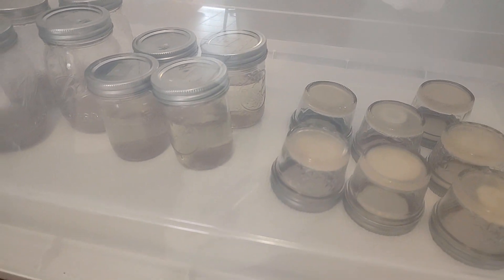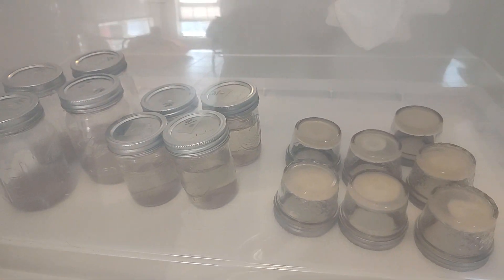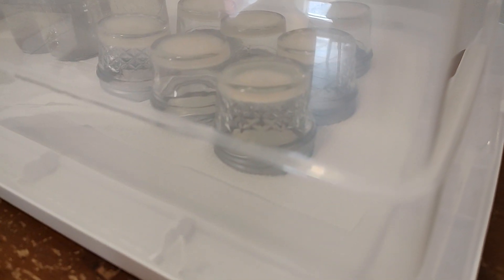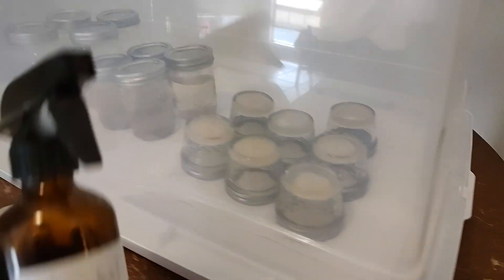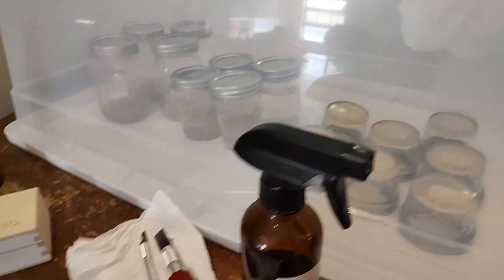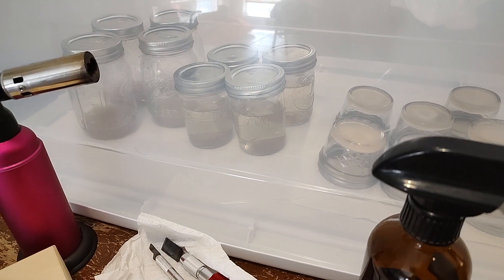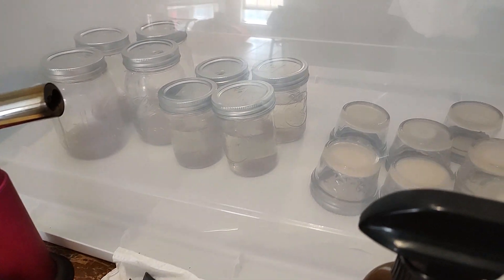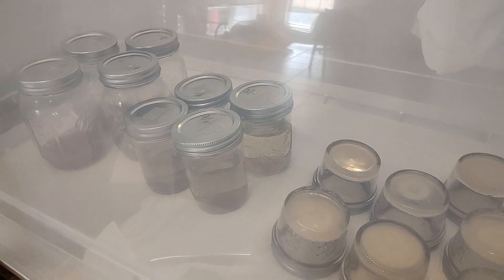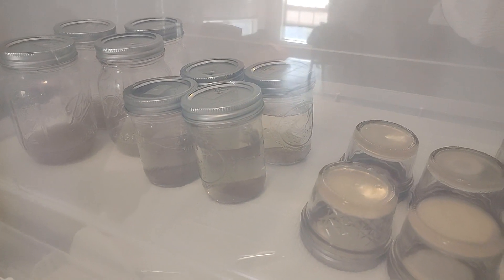Many of you have had questions and requests to see things in real time and what it looks like, so this is what it looks like right before we do these transfers. Everything has been sanitized and sterilized with 91% alcohol. We'll be wearing gloves and there will be sterilization of the tools. We'll keep you updated on what these LCs and slurries look like. Much love, friends.